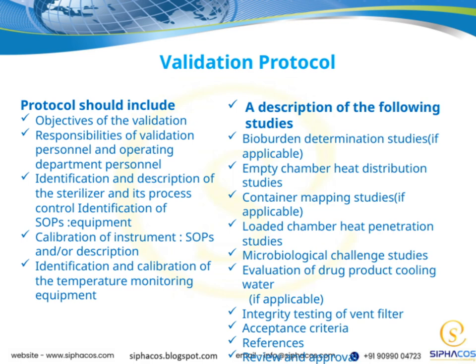Next, we consider container mapping studies, again if applicable, to assess how sterilization parameters perform with specific container types.